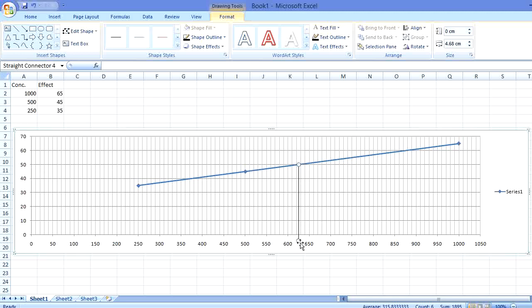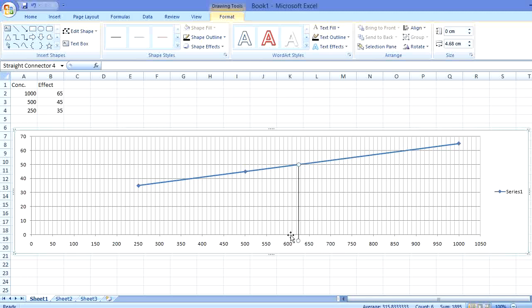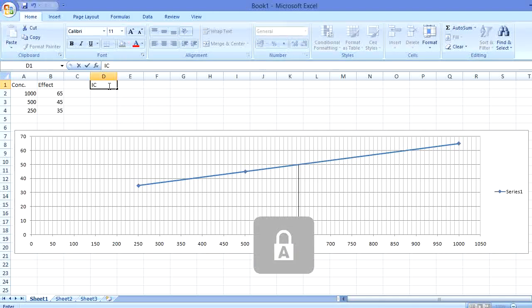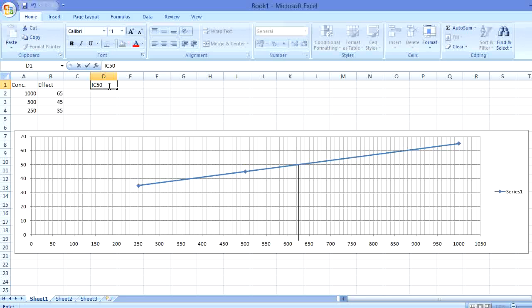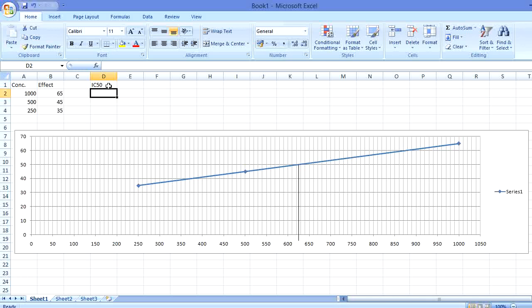We will intersect this 50% line down to the baseline — the horizontal axis — to get the actual concentration. We can see this line intersects between 620 and 630, so the value in between is 625. We have found that the IC-50, LD-50, or EC-50 for this data is 625.